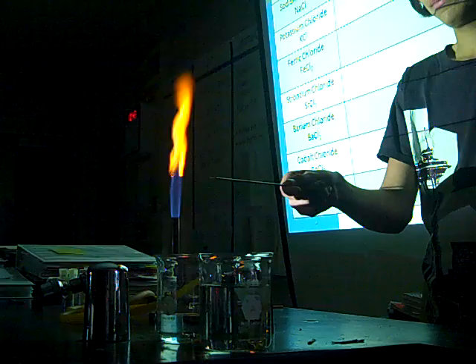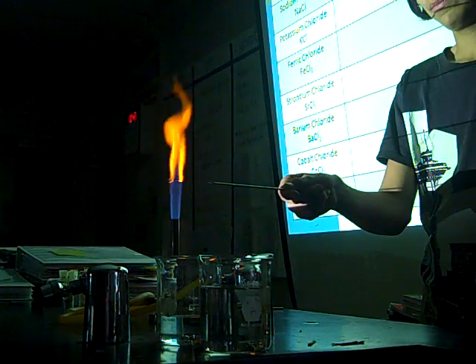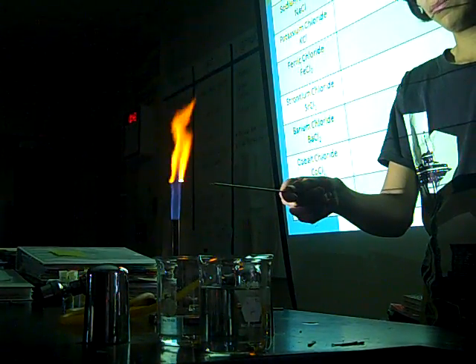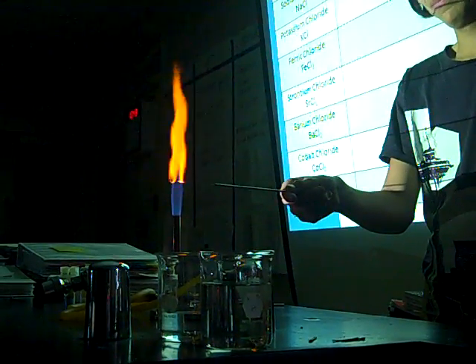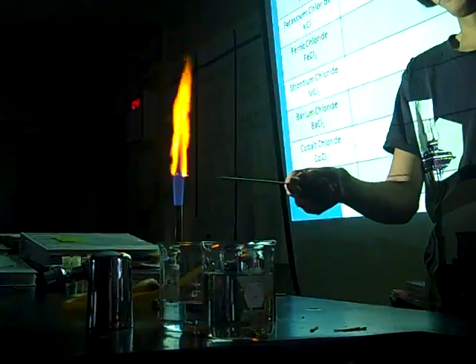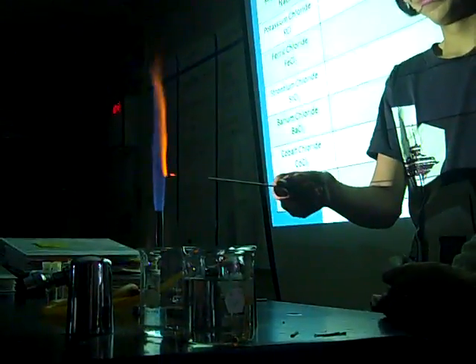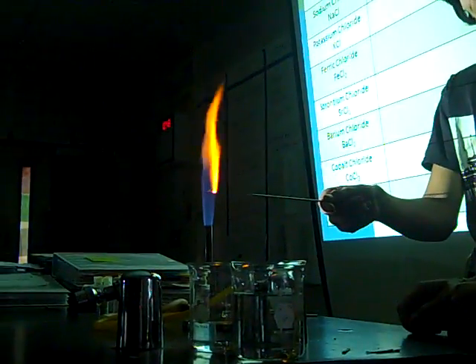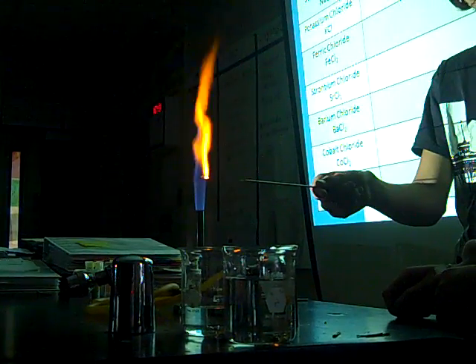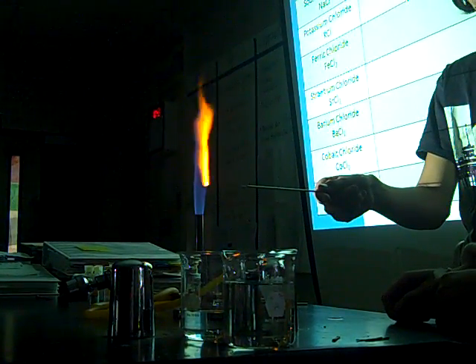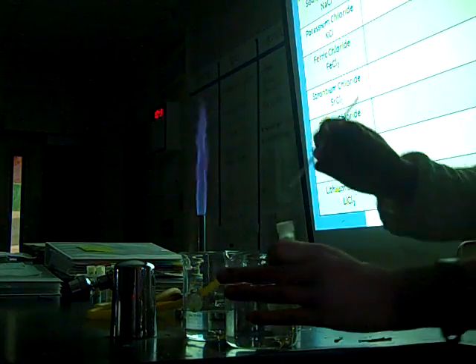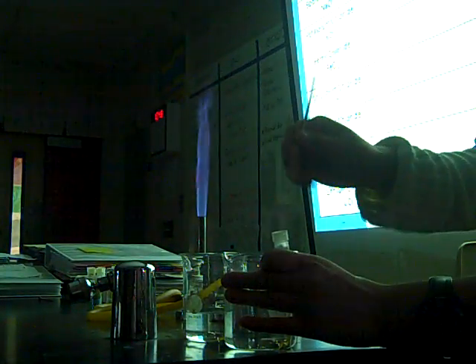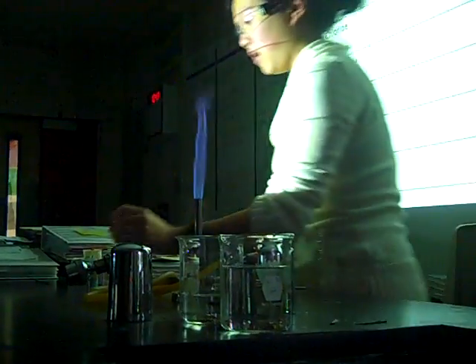Ooh. Barium chloride. What do you guys see? It's orange. Kind of a orangey color, right? Yes. That's the color of the fake fire in the teriyaki color. I didn't think about that before. All right. Barium chloride. Yeah, I put a big chunk on there. Now it's probably all melting onto the dipper. All right. Great. Thanks, Nick.